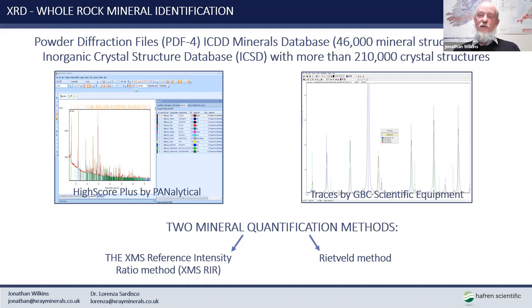I mean, it is staggering when you look at the number of bona fide mineral species which are thoroughly understood today. And of course, the recognition of some of the more obscure ones is based almost entirely upon X-ray diffraction, because studying their pure crystallography is necessarily ambiguous in many cases, or perhaps you only have minutely small amounts of this material to examine. There are also additional databases which deal with other crystalline materials, such as proteins, pharmaceutical materials, all of those. We could probably operate our lab to advantage if what we were doing was looking at the materials which are used to cut recreational hallucinogenic drugs, for example. It is not our business, and I'm not going to go there.